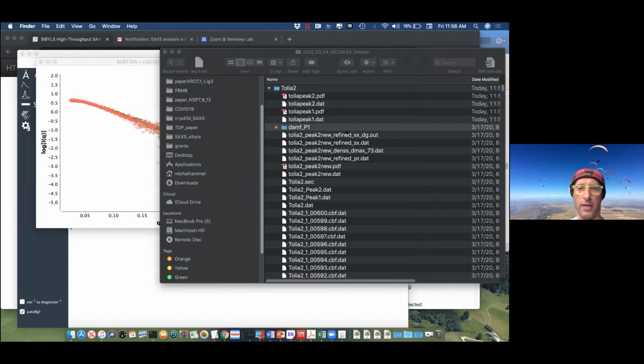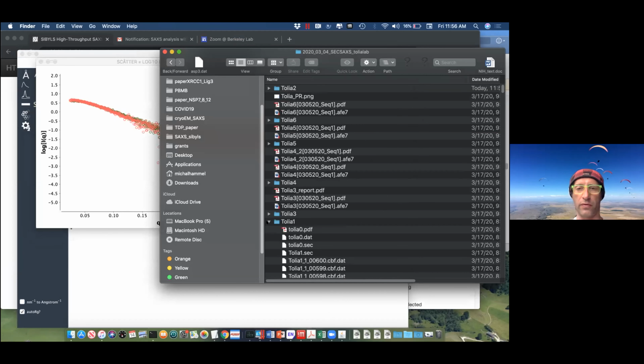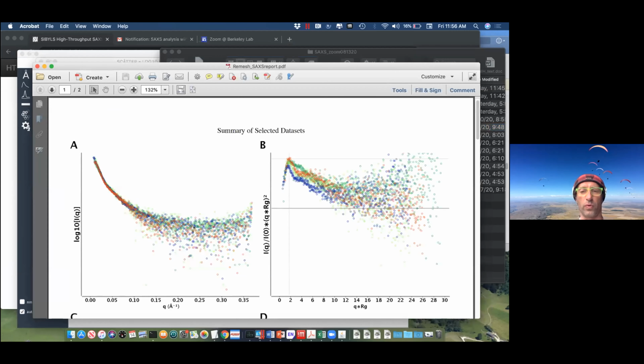I would say again, with your data in your package, you also get a very general report. If you look at your report, for example, this is for the user, you get the basic information about your curves. So all this is done for you. You don't need to do that. You can take the final scattering profiles that are in the package.